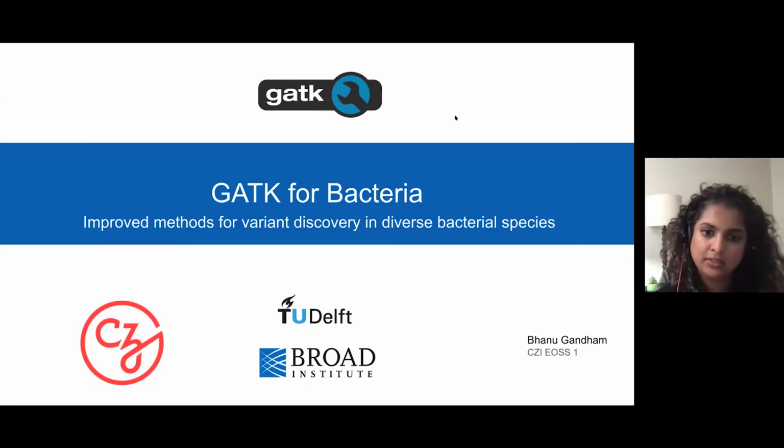Hello, everyone. My name is Bhanu Gandham. I am a bioinformatician at the Broad Institute. I lead a team that is responsible for the adoption and optimal use of GATK tools. Today, I'm going to be presenting on our project called GATK for Bacteria. The focus of this project is to develop methods for variant discovery in diverse bacterial species.